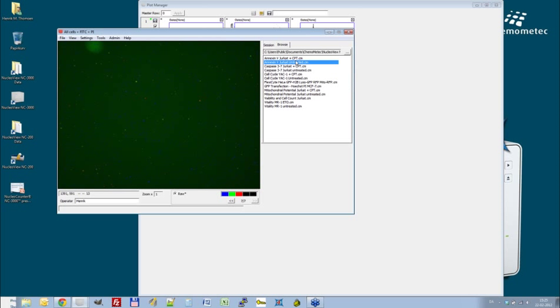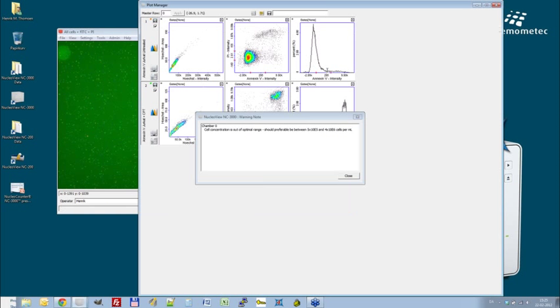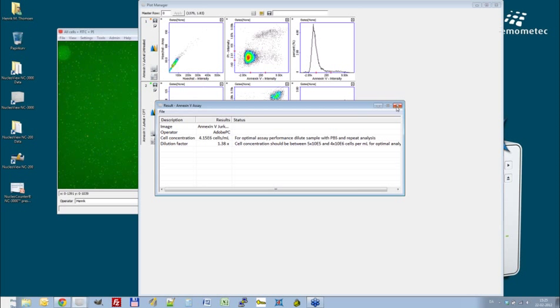And if we compare with our treated cells here, we see a warning because the cell concentration was out of range. It's not really much out of range, but our instrument will warn you, because if you're out of range in cell concentration, there might be some staining kinetics that will not work, or statistics. If you are under range, the statistics might be bad. So this is a warning our instrument will give you.